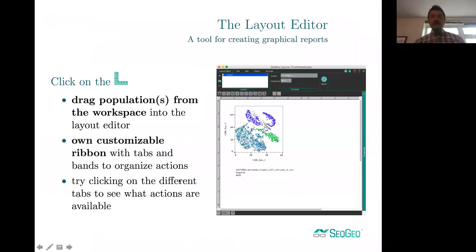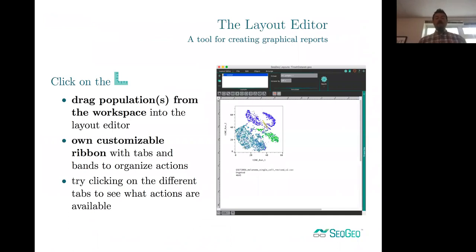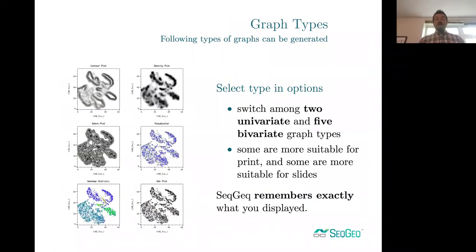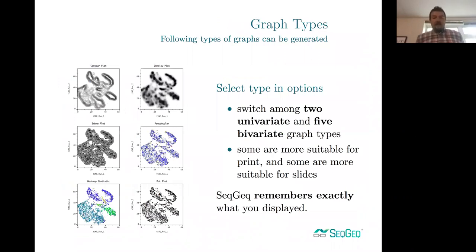Ways of exporting information from SeqGeq: the layout editor is a convenient way to view different plots side by side. Just as you set up graphs in the graph window, drag populations into the layout editor to visualize them in a handy format and export publication-quality graphics. You can also change graph types within the layout editor — contour plots, density plots, zebra plots, and a whole variety of other plotting options.